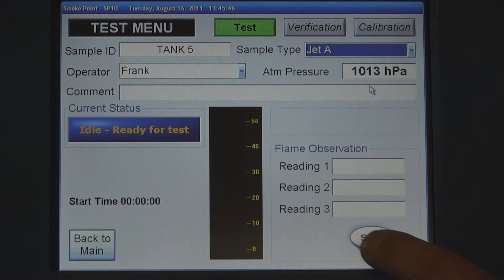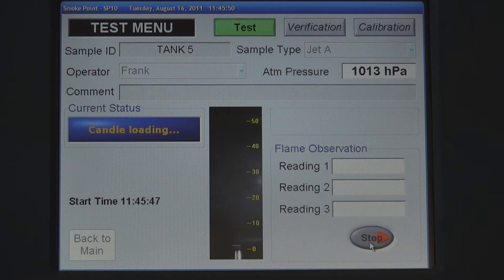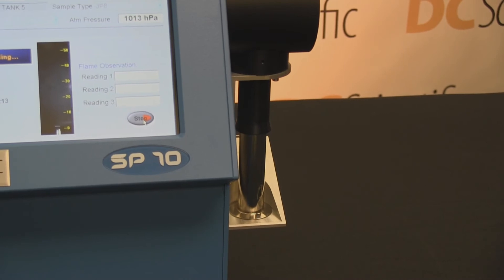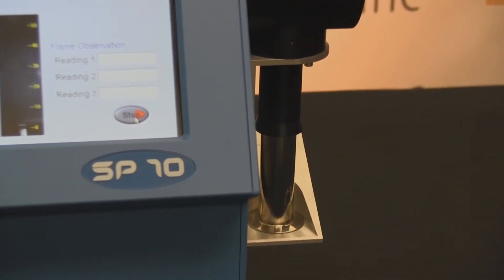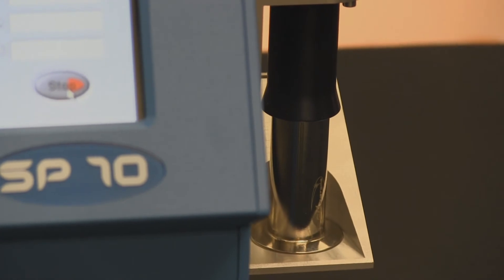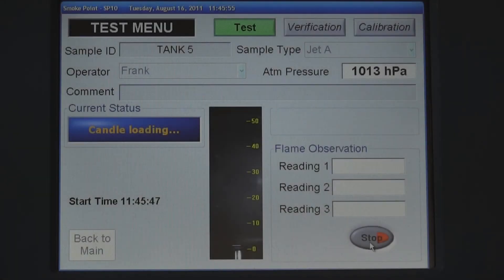Press the start button. The blue status bar on the left of the screen indicates that the candle is loading. The candle is raised into position, and the camera assures the conveyor raises the wick into position.